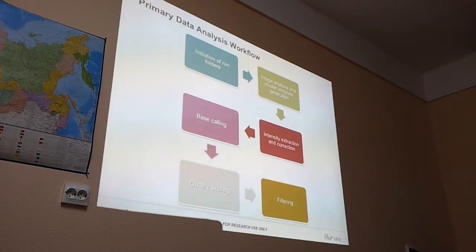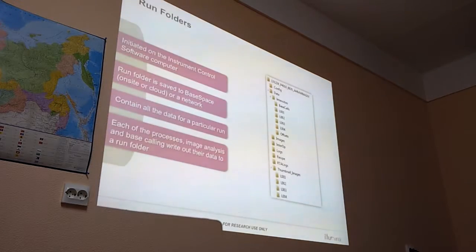And so this is common for our systems, and this is why, even if you work with microRNA, you should not make reads that are smaller than 25. So 26 is kind of minimum. I think you know the structure.